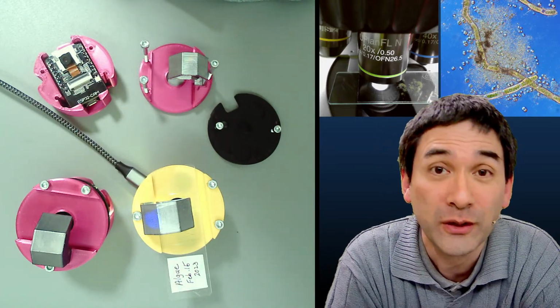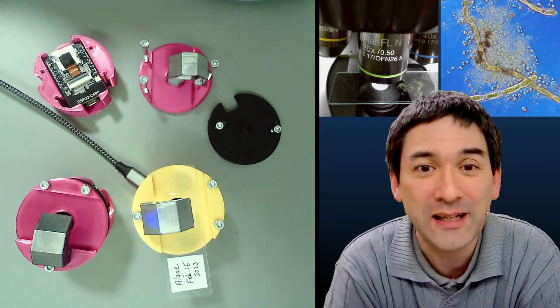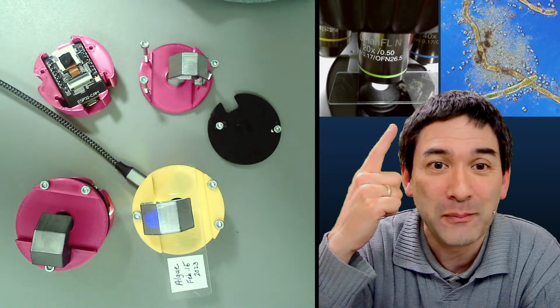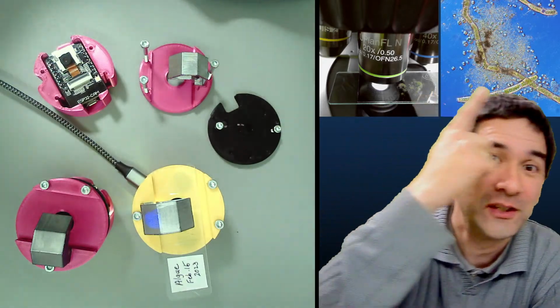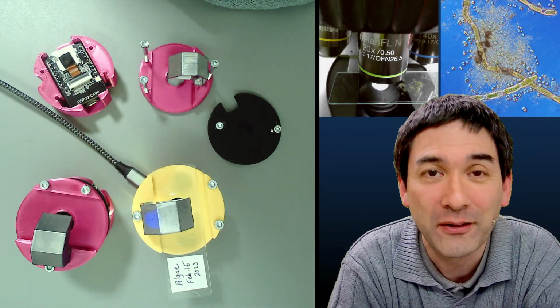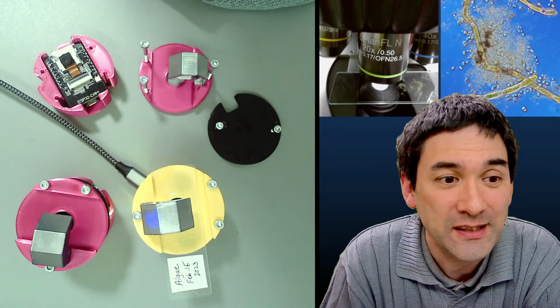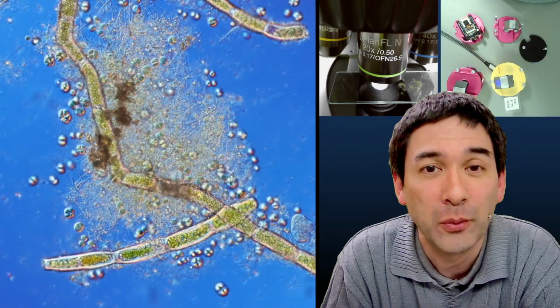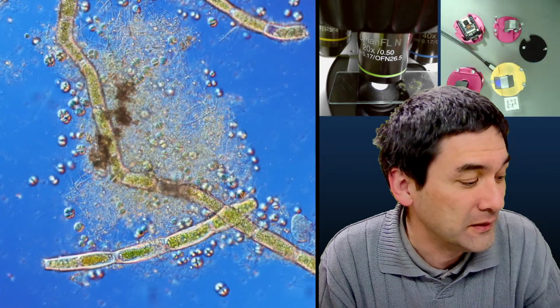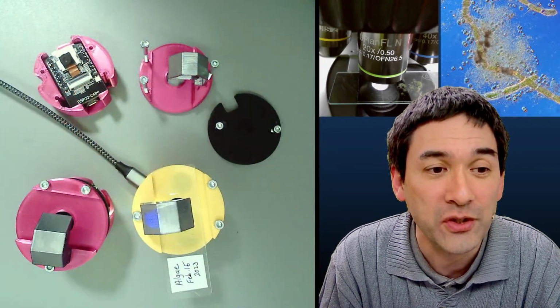And you can also see that the setup today is a little bit different. I now included the desktop on the side here. The microscope view is here, and then there's another microscope view of what you can actually see through the microscope. So everything's a little bit more cleaned up now, and of course I can also change the setting around so that, for example, if you want to look through the microscope directly, that's basically the thing that you can see right now. So it's a live view as well.